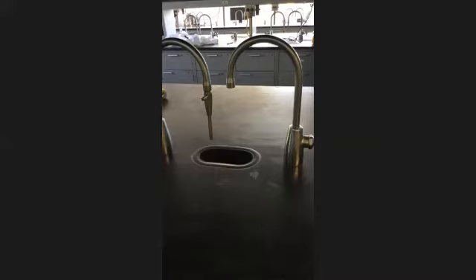So let me show y'all that part too. If it calls for cold water, what you can do is take the base off the graduated cylinder and just stick it down into ice, into a cooler or an ice bath or whatever you want to do. Omar added water to his and it immediately turned cloudy.